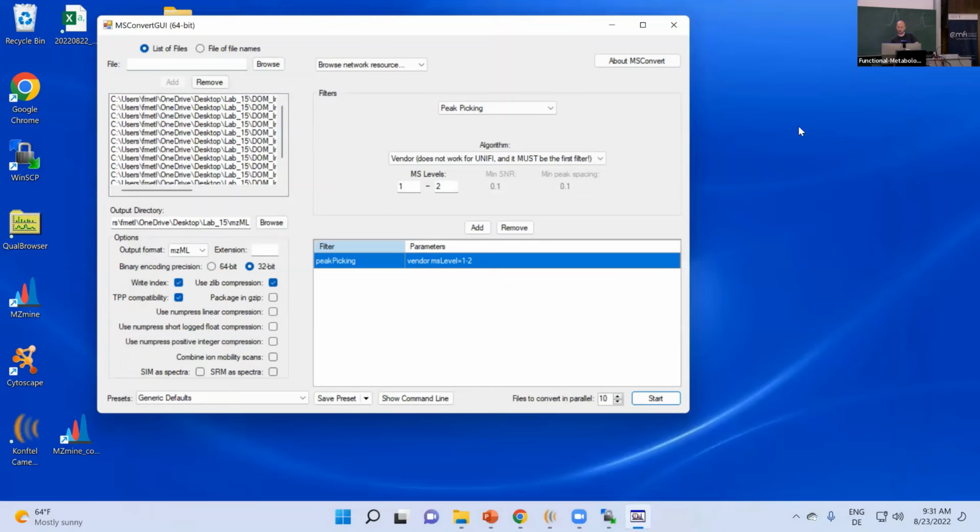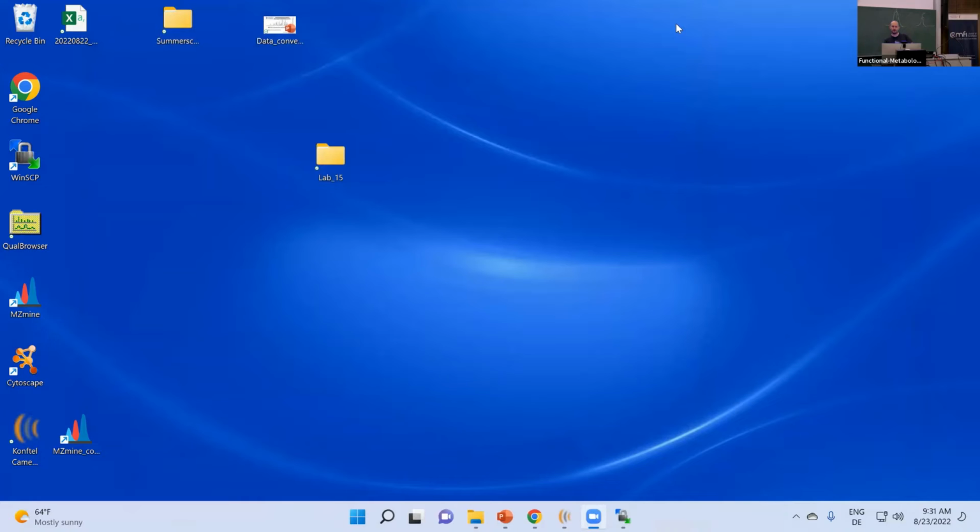So now this is ready to either be processed with MZmine, or let's assume we just acquired this data and it's not in the public domain yet. For us, the first step would be to upload this to MassIVE and make a public data set out of it. And with that, I give over to Allegra, who's going to walk you through that.